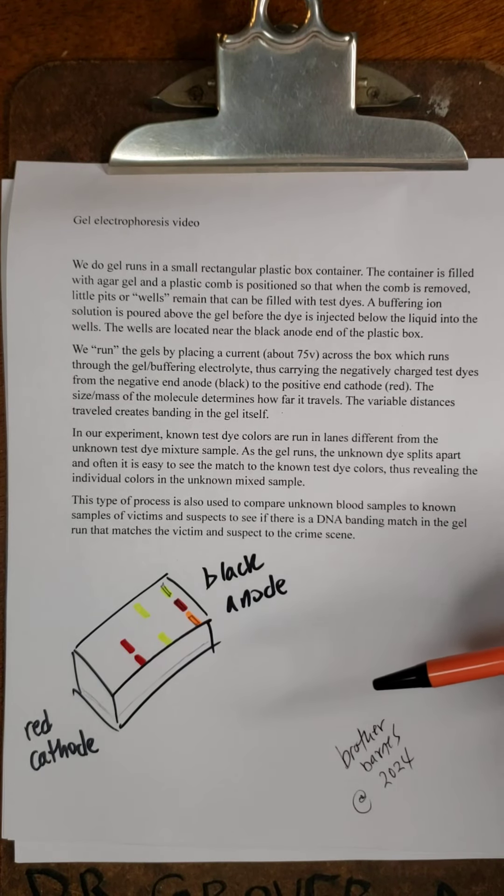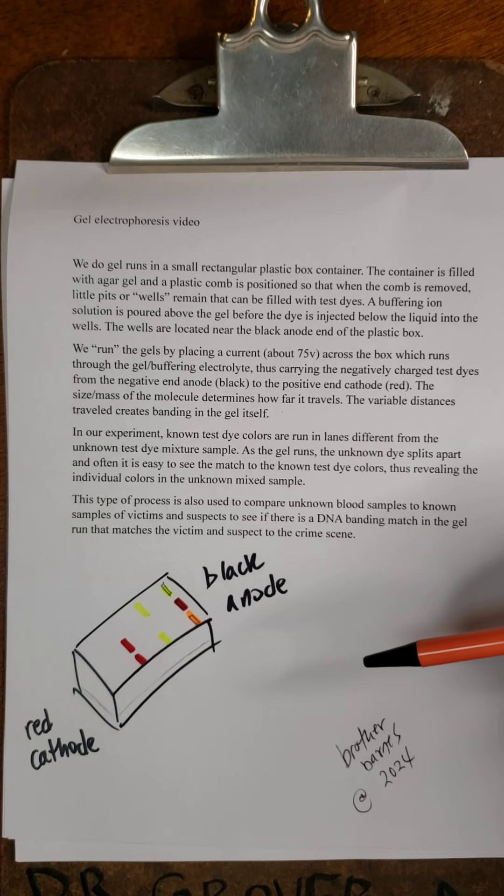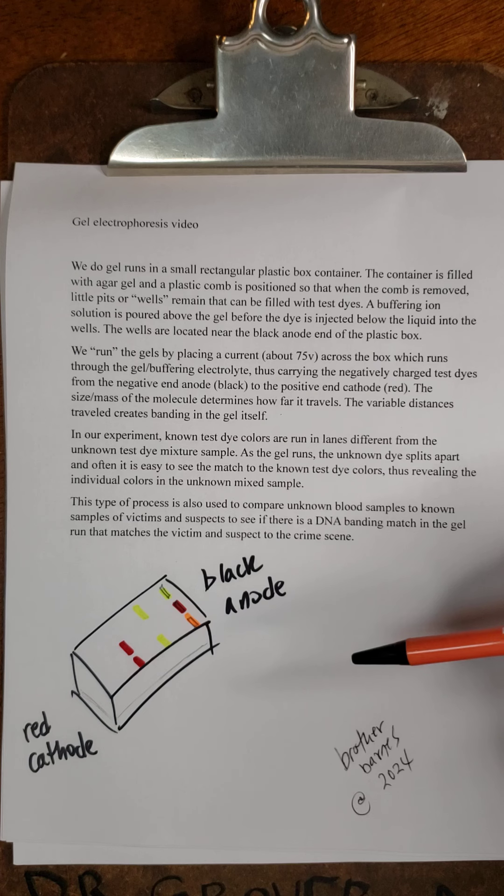Hi, this is Brother Barnes, and I want to talk to you a moment about the gel electrophoresis runs we do in my general one biology lab.